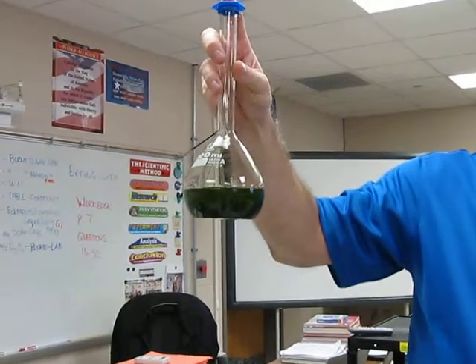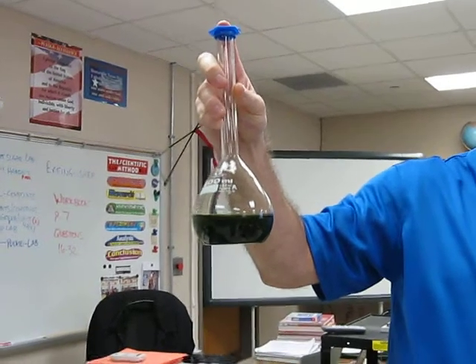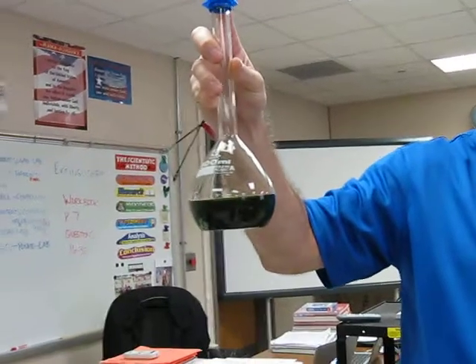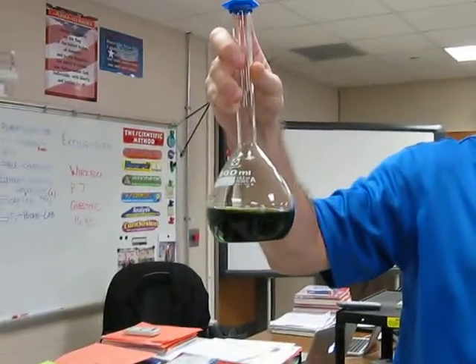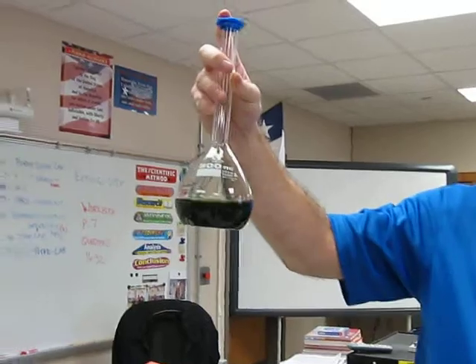So this is called a stoplight reaction. There are actually two reactions that take place, and it has to do with the amount of oxygen that we're mixing in with that solution in there. So you saw it turn amber, then it went to red, and then it went to green, right? Stoplight reaction — cool.